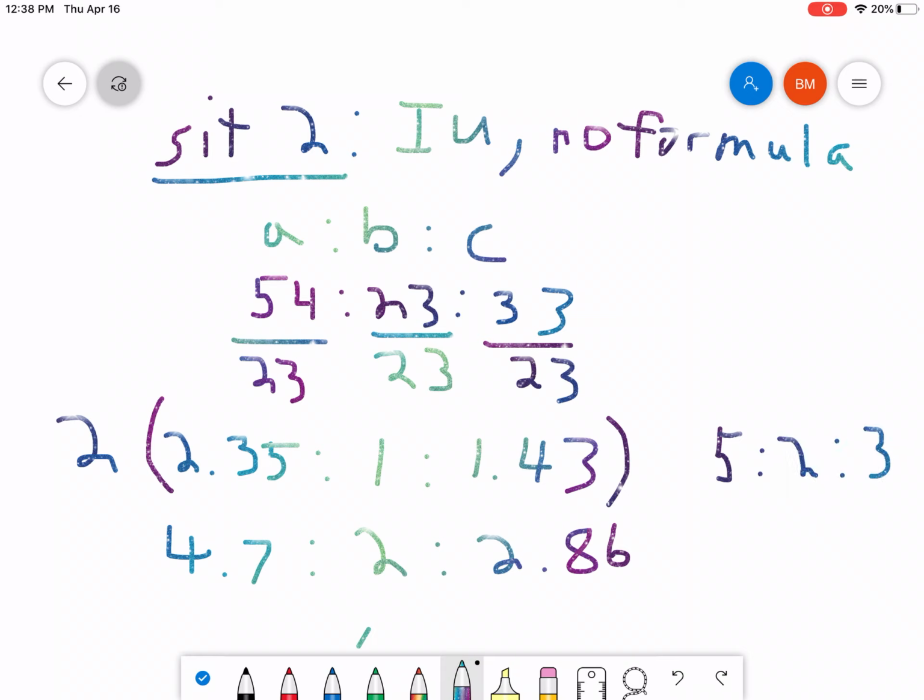All right, so this method turns out a little bit rougher sometimes, but usually it will get you where you need to go, in case you don't happen to know your molecular formula. And realistically, if you're working in a lab somewhere, you might not know this. Maybe you just synthesize something and you're trying to discover what the structure is, right? So this is a good way to do it if you have integration units but no formula.